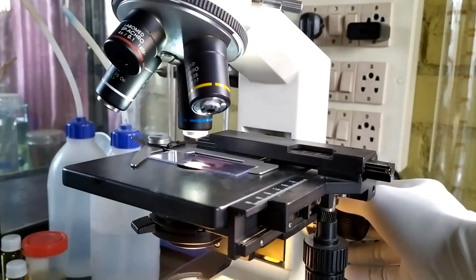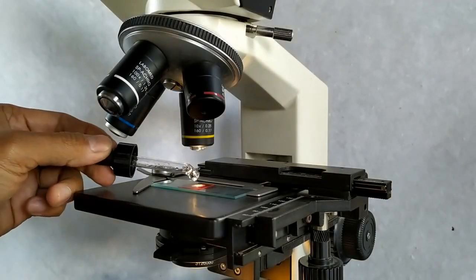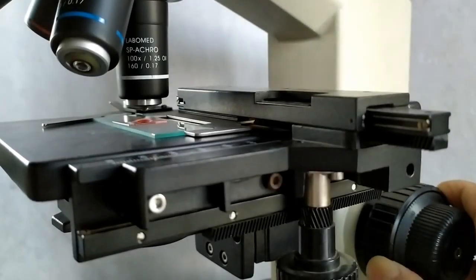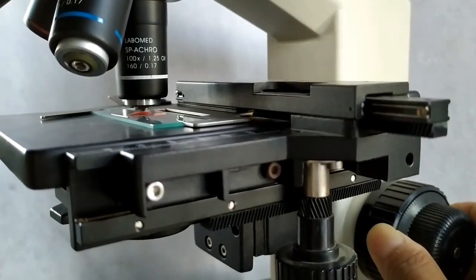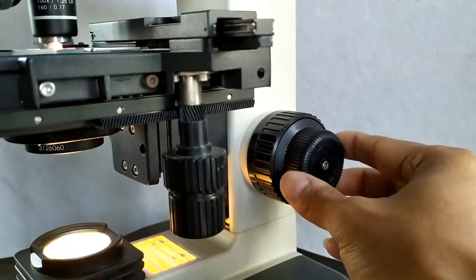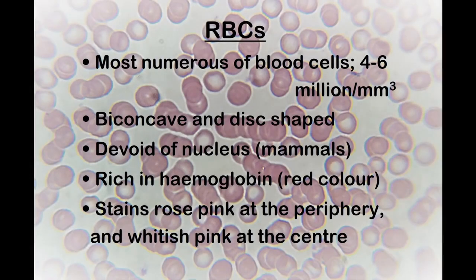Observe and study the various blood cells under 40X and 100X objective. For 100X, place a drop of immersion oil on the slide. Gently lower the 100X objective until it touches the oil surface. Hereon, use the fine adjustment knob for focusing. The following microphotographs show the various cellular components of human blood.